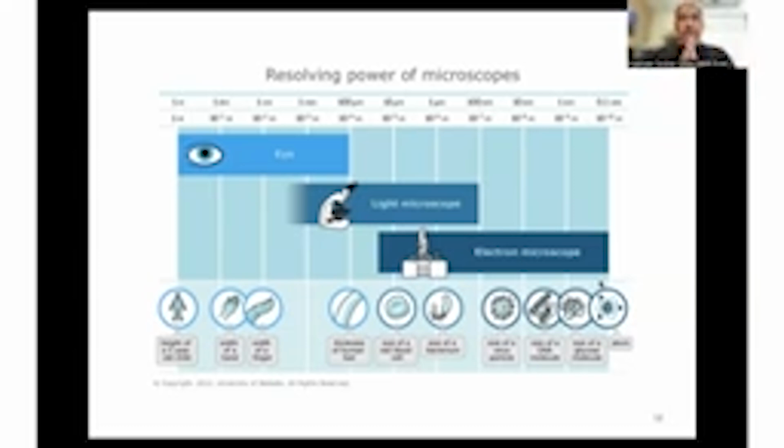Also, as I said, the beam of light, or the beam, because it's not just light, it could be, say, electrons that you're using to illuminate the sample, has a significant effect on the quality of resolution, because light has a certain wavelength, and that ensures that it will be able to only separate two objects that have a separation that is more than the wavelength of light, right? So if they are really, really close, chances are the wavelength of light becomes limiting in being able to resolve these two objects.